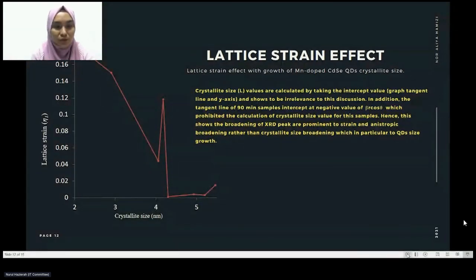The temporal evolutions of manganese doped cadmium selenide quantum dot are presented in absorption and emission spectra. The optical band gap behaves negatively exponential to the growth of quantum dot size, whereas the excitation energy shows typical approximate linear relations. The lattice strain shows a crucial effect on the exciton band compared to the optical band gap.